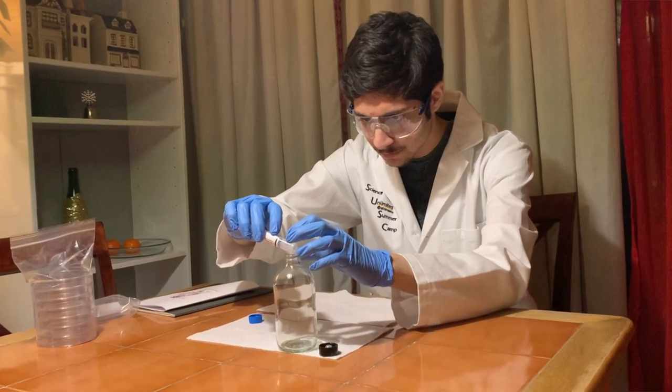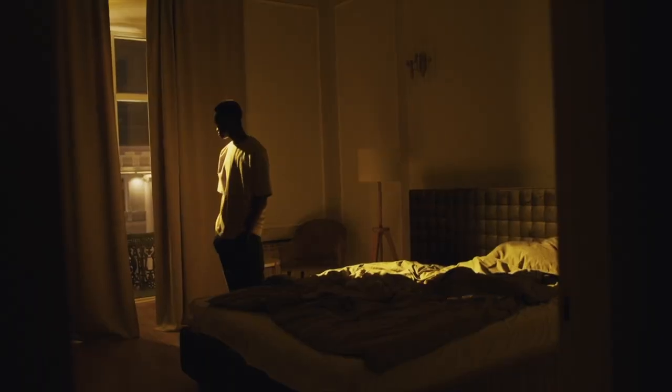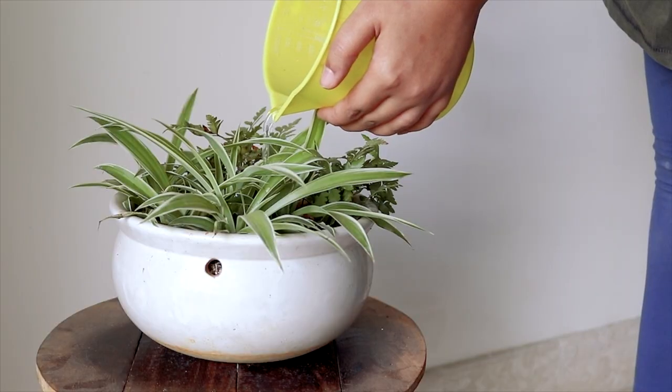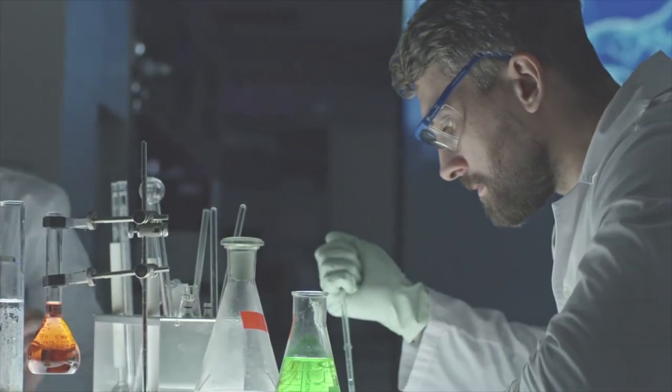Hey, my name is Gibran and this is how I started my own genetic engineering lab from home. Lately, I've just been really bored at home with the pandemic and lockdowns and COVID-19, so I thought of starting something new at home like gardening, baking, knitting, but there's something better that I could do. So I thought, what if I could start my own genetic engineering lab at home? And that's exactly what I did.